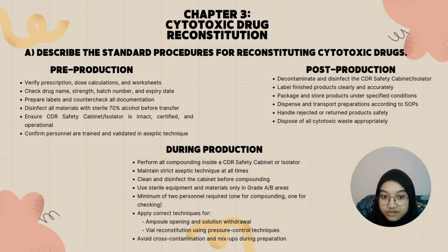The cytotoxic drug reconstitution safety cabinet or isolator is checked to ensure whether it is functioning properly or not. Only trained and validated personnel are allowed to perform this process. These steps are crucial to ensure accuracy, sterility, and safety before compounding begins.